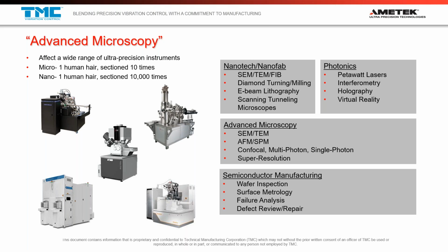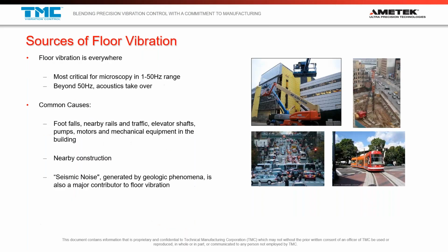vibration. Somebody walks by in the lab, or somebody bumps your instrument. This type of thing can cause all sorts of problems in the image, and it's a challenge that advanced microscopists are always dealing with.